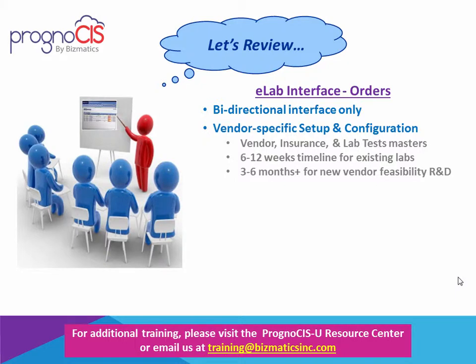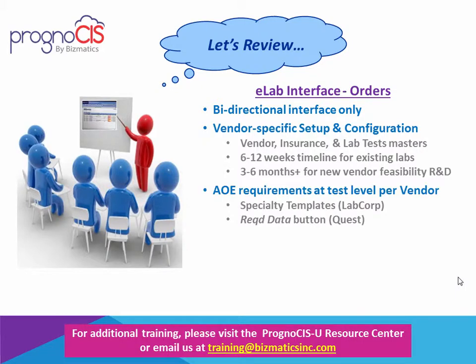For existing labs, such as LabCorp or Quest, it's a typical 6 to 12-week timeline. We do interface with any vendor in the nation that provides an HL7 transaction record. For new vendors that we have not yet gone live with, however, there could be a 3 to 6 month or greater timeline to establish the vendor feasibility and then to get the interface up and running.